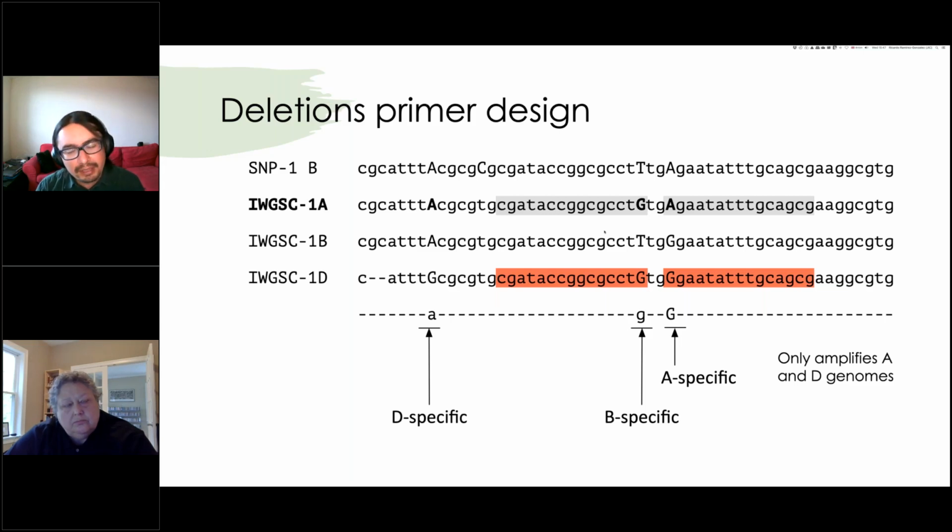And for the amplicon version, if you have a long sequence, it will give you all the possible pairs that are genome specific on that range. So it's not that limited. I think it has a default of 200 base pairs product, but I think it can go further. Again, we haven't used this as heavily, so I don't have exact numbers, but yes, it can be done.